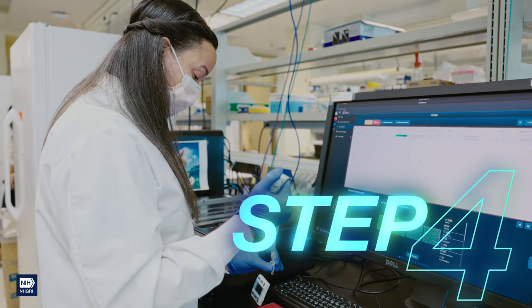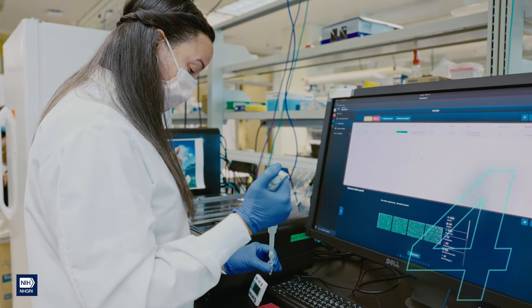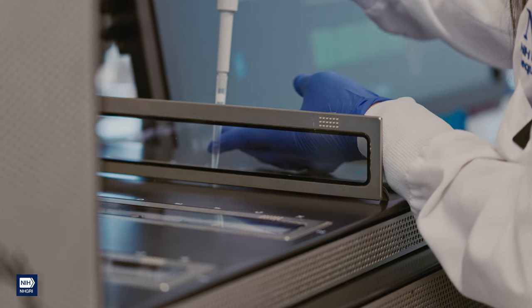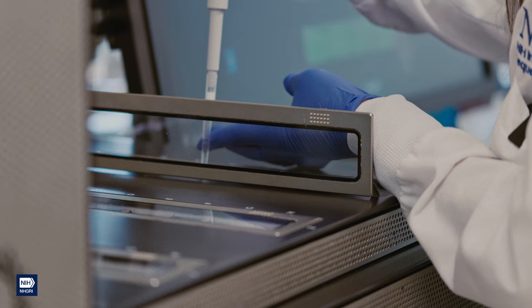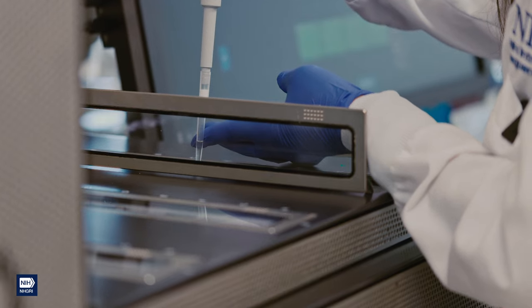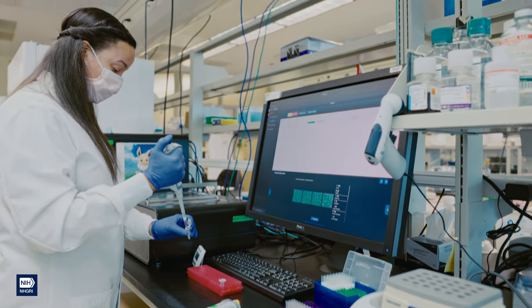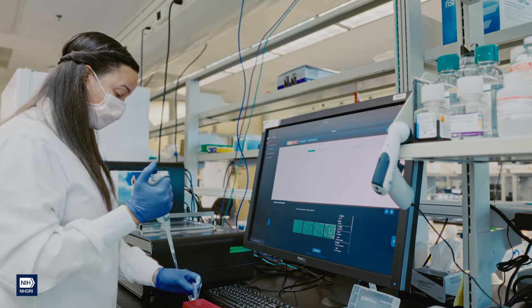Step 4: Load the sample into your favorite sequencer. If you're like us and just can't decide, use both. This one may look like some kind of space-age toaster, but this toaster feeds DNA strands through tiny, tiny holes called nanopores and reads the individual nucleotides as they pass through the pores using some fancy electronics.